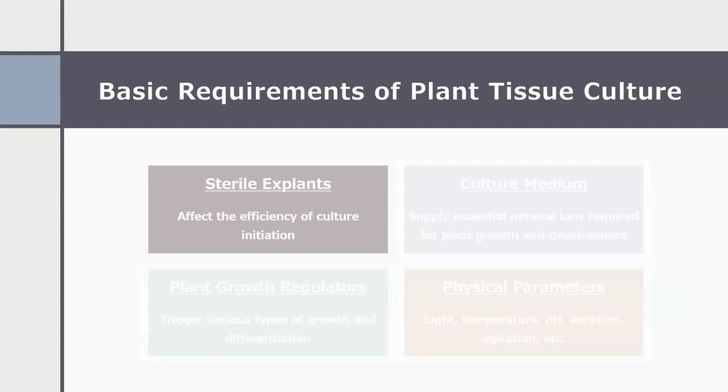Plant tissue cultures are generally initiated from sterile pieces of a whole plant. These pieces are called explants, and may consist of plant organs, such as leaves or roots, or specific cell types, such as pollen or endosperm. Several characteristics of the explant are known to influence the efficiency of culture initiation. In general, younger, more rapidly growing tissue, or tissue at an early stage of development, known as meristematic tissue, is most effective. When cultured in vitro, all the chemical and physical needs of the plant cells and tissues must be met by the culture vessel, the growth medium, and the external environment.